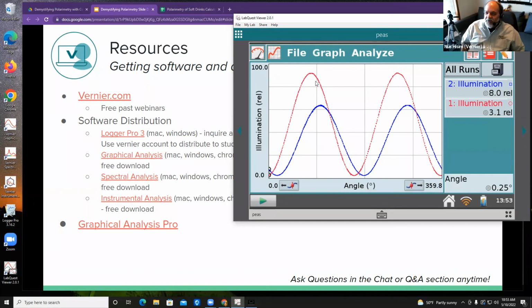Does any of the other software replace Logger Pro if a student cannot run Logger Pro? The question came up in the chat, and I'll throw it out there too. For most of our sensors, like temp probes or pH probes, the Graphical Analysis software works fine on any platform.